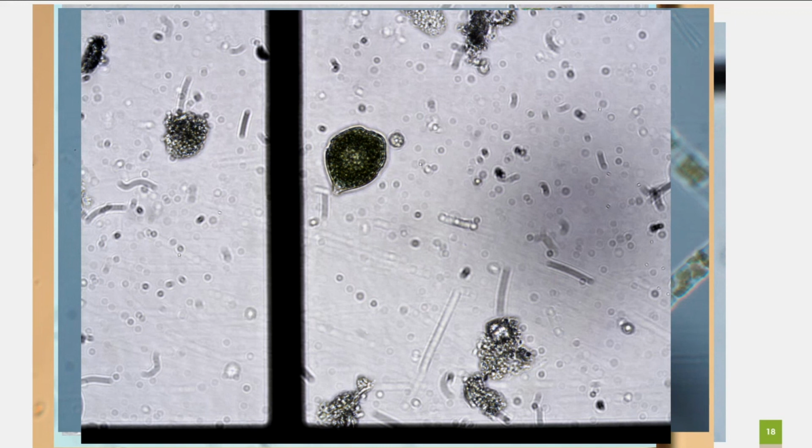Do you want to answer this? You want me to? Yeah. Especially with Alexandrium, first of all, we don't identify the species, so it's just that genus in general. But we do tests where we can identify presence or absence of the toxin in general. If there's no toxin present, then we don't go any further. If there is toxin present, then we will go a step further and do additional testing that will give us a certain number of toxicity, based on the requirements that we have, in the levels.